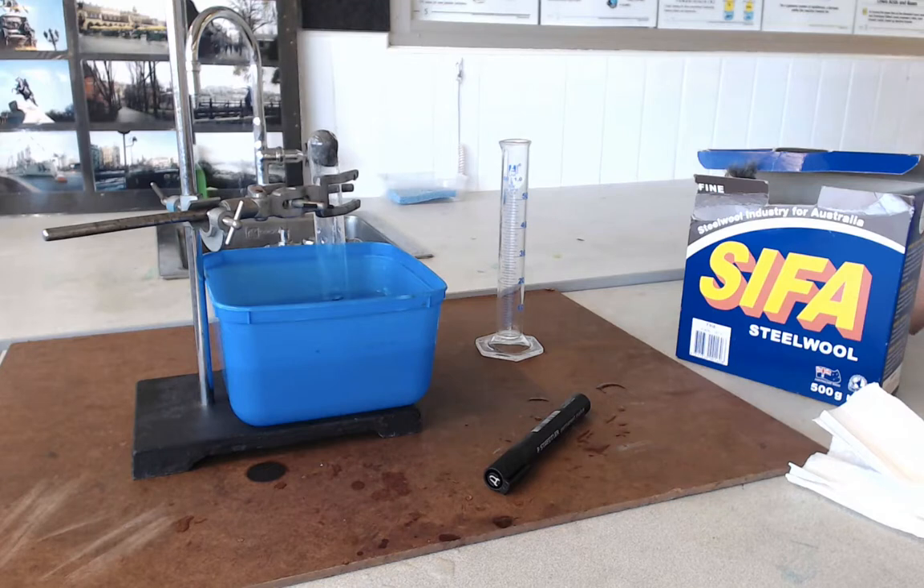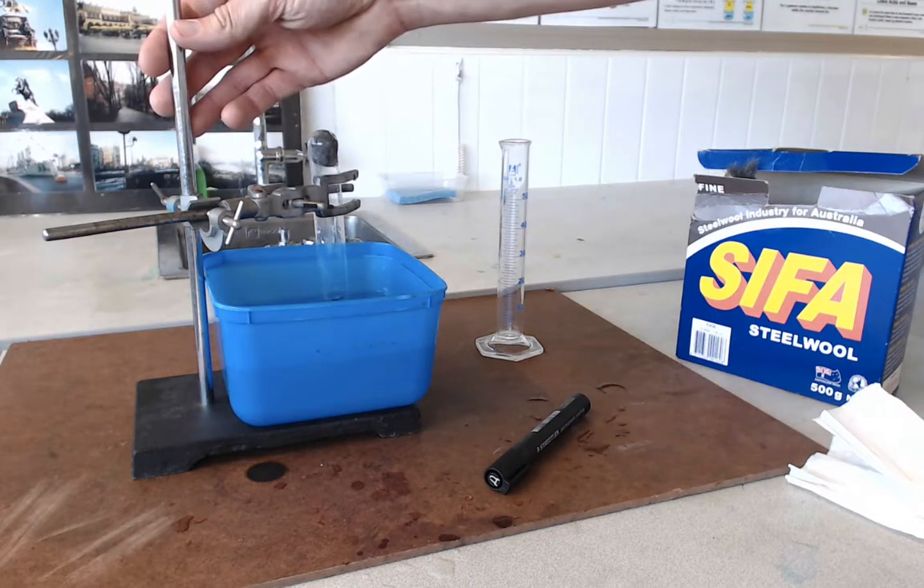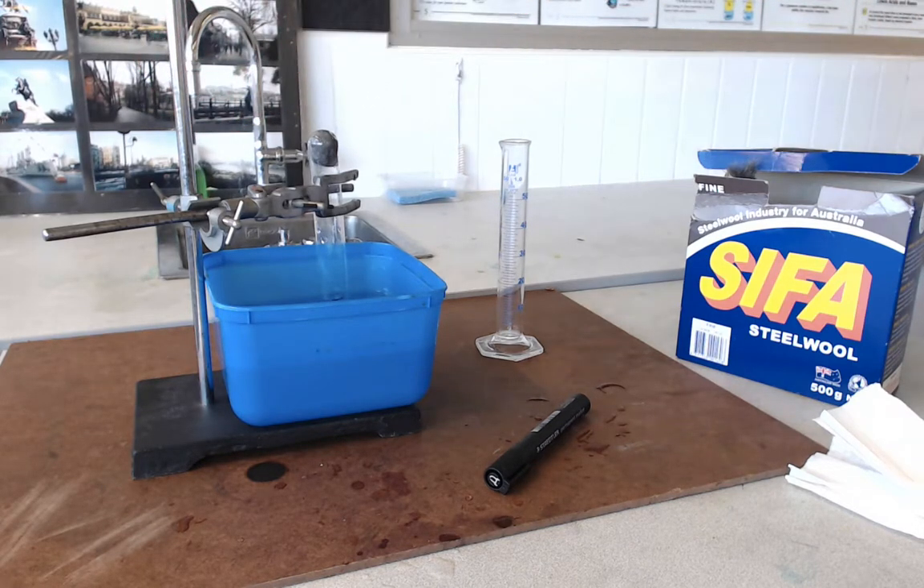Now this is a slow reaction — this combination reaction — so we're going to leave it for two or three days. It would be best if you actually set it up where you're going to want to leave it, because obviously you don't want to carry this whole apparatus around with water sloshing around in it. So when you're setting this up, try and do it where you're going to leave it — for example, at the side of the room.